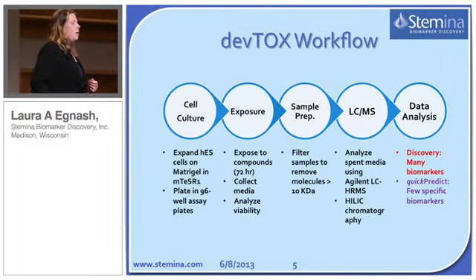Quickly, the workflow, we began with cell culture, and it's in a 96-well plate format. We then expose the cells to compounds over 72 hours. They're dosed daily. An important point here is that we collect the media. We don't look at intracellular metabolism, but rather the footprint, the metabolic footprint the cells leave behind in the media.